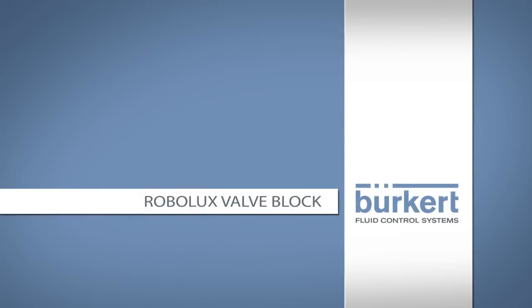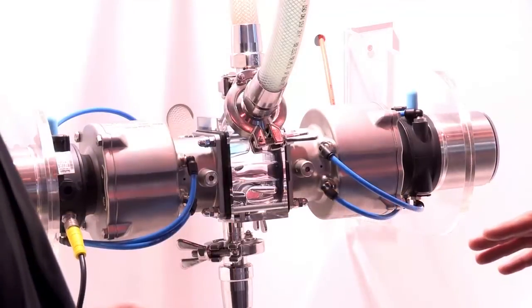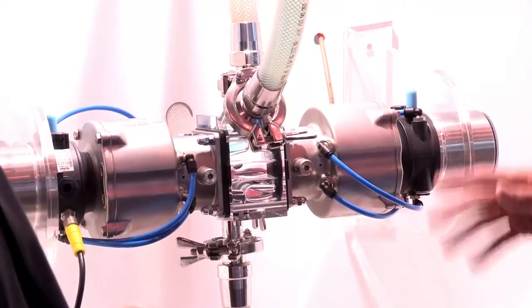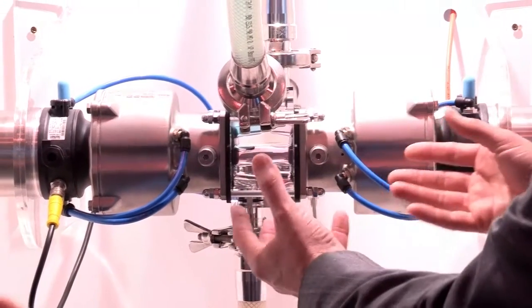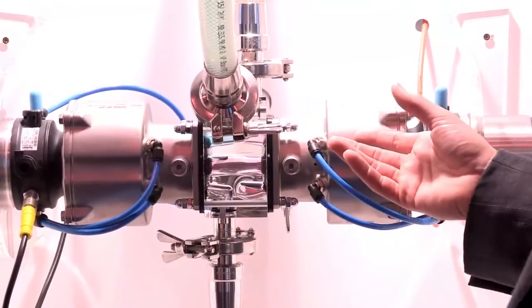The Robolux block solution is a solution where we have two seats in one. It's a diaphragm valve seat and we minimize the design of a complete installation. These are requirements which have been asked for in clean rooms.